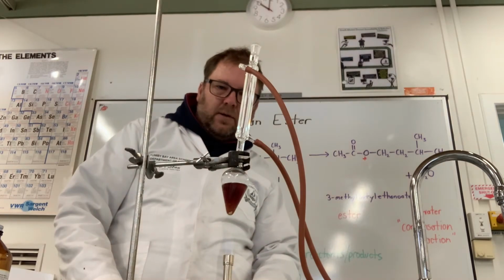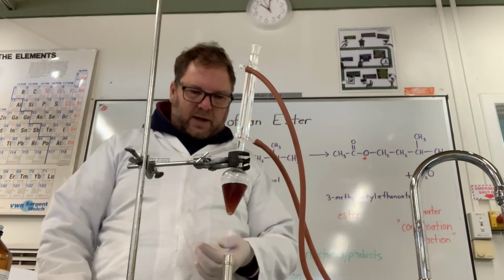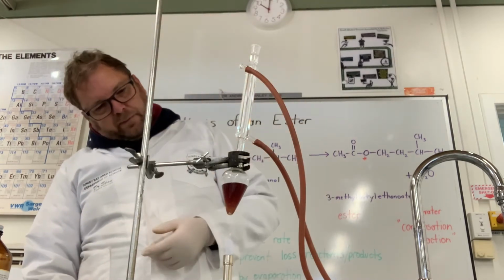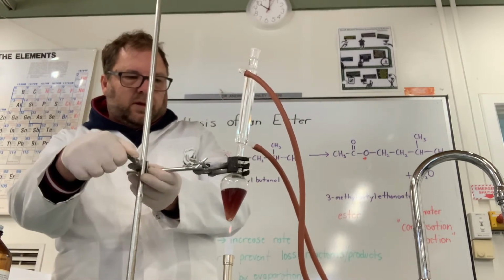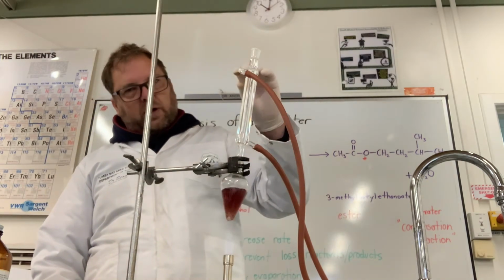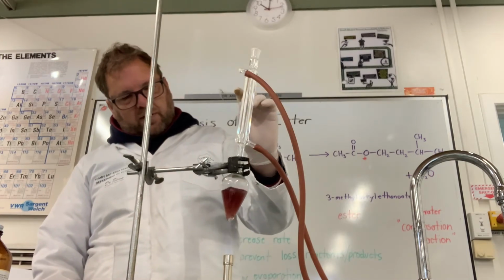And that is reflux. Boiling away gently so that we're providing heat. The vapors that are forming probably just go down a little bit again, I reckon. The vapors that are forming are coming up into the condenser. The cold water in the surrounds of the condenser is causing them to condense.